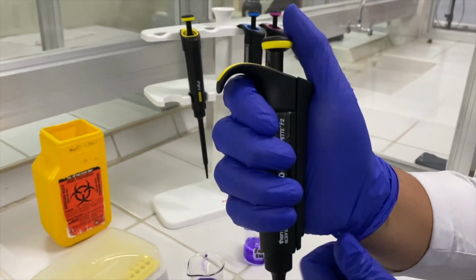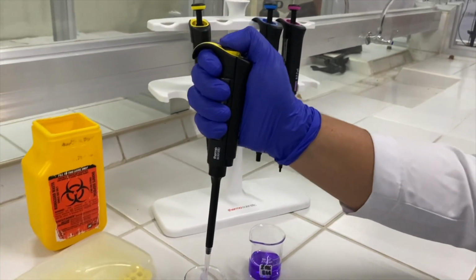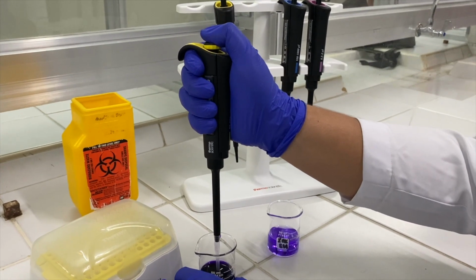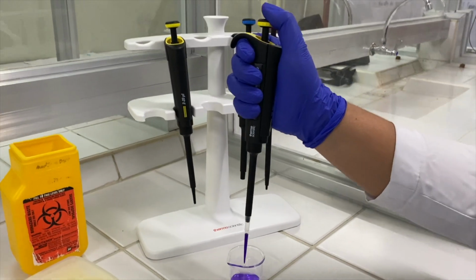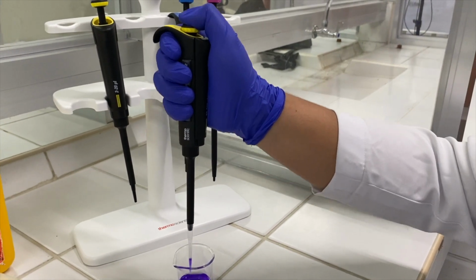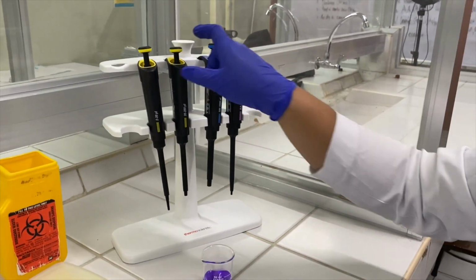For the reverse technique, you aspirate by gently pressing the plunger until the second stop and slowly release to aspirate. Again, pre-wet your tip before fully aspirating the solution. To dispense it, press the plunger until the first stop only. The reverse technique is actually appropriate only for viscous and foamy solutions.